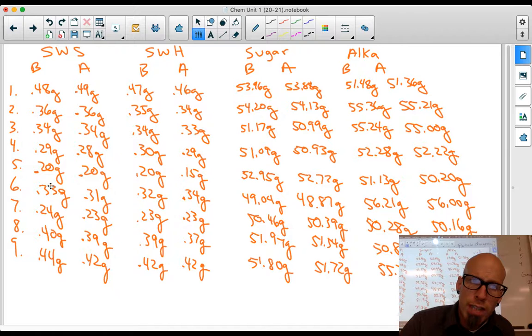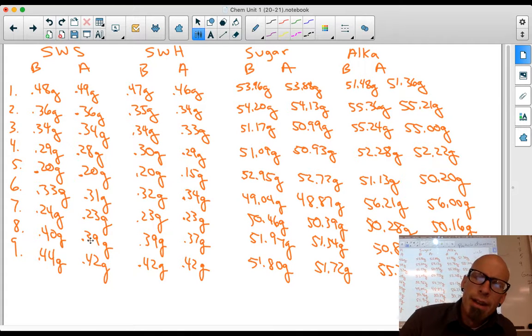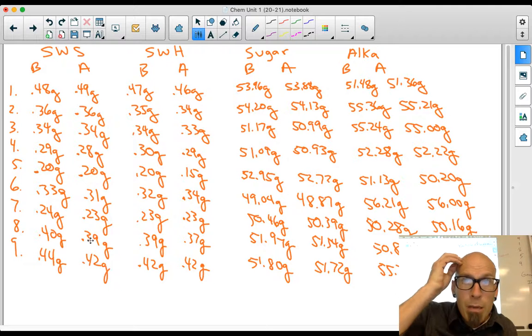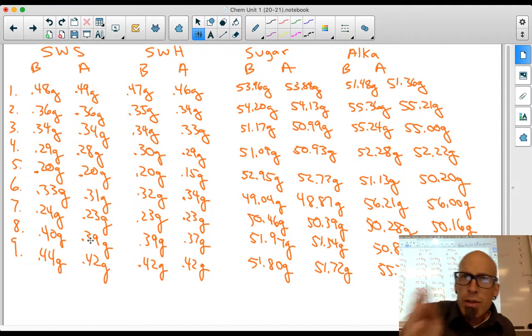This group was starting to say the same thing. It went down by 200ths. Now this group, it went up by 100th. This group went down by 100th, down by 100th, down by 100th. What we found out was that we're not sure if 100th changing by 100th is that much. I mean, it doesn't seem like that's very much, 100th. In fact, some people said that their readings were bouncing back and forth between 2 values, up 100th, down 100th, up 100th, down 100th, and then would finally settle in on one value.